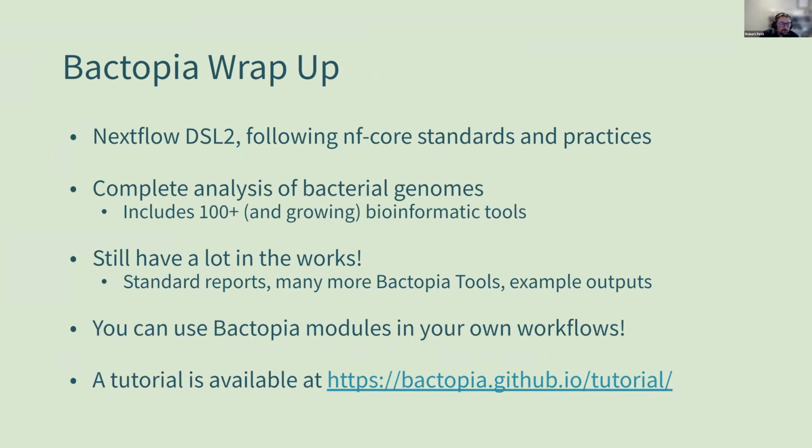So just a quick wrap up. Bactopia is completely DSL2. If you're getting into Nextflow, I would try to ignore as much DSL1 as you can and just jump straight into DSL2. I was hesitant at first, but now I'm kind of grumpy with myself for taking so long to make the conversion.